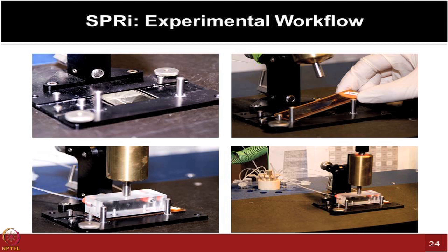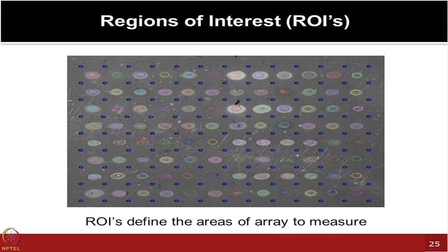So these kinds of platforms could be used, and it results in these images, which are the pseudo images that I mentioned to you. It shows you these kinds of spots. Now all these red, green, these are actual spots, but along with them, the gray color is just the background. So software artificially adds some blue colored dots. These spots could be used for subtracting the background.